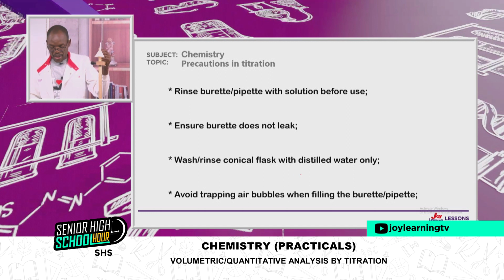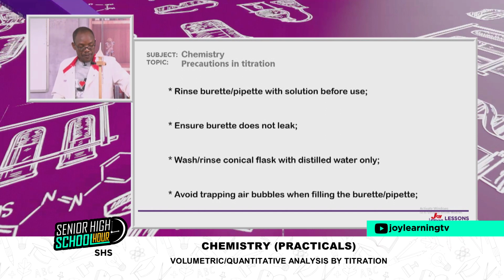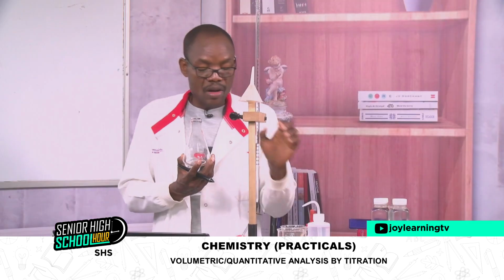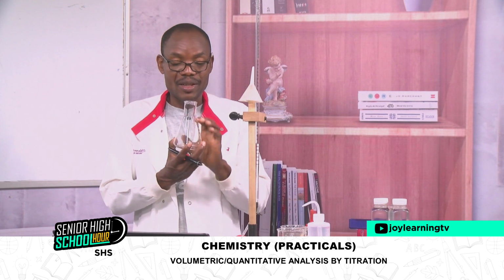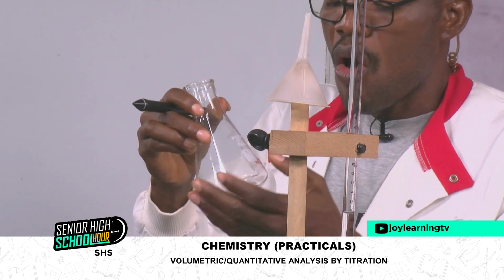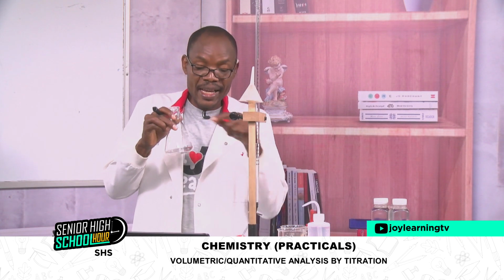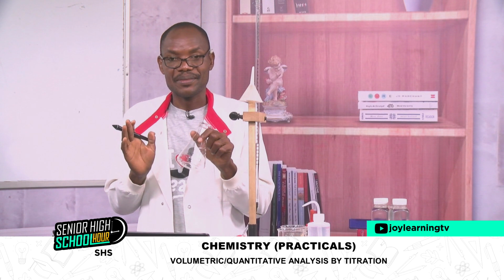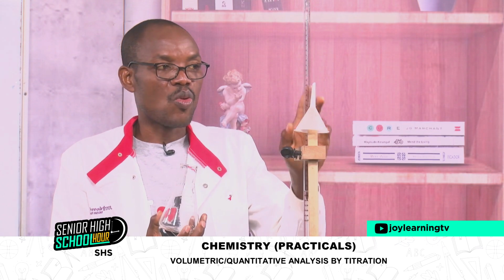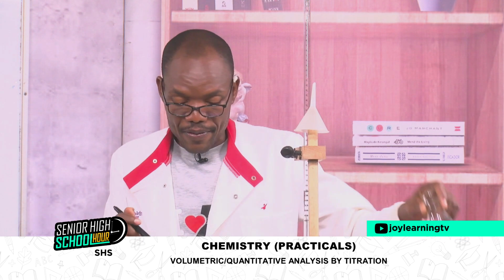Wash or rinse conical flask with distilled water only. If, for example, I'm going to use the base inside the conical flask, and I use a small amount of the base to wash inside the conical flask, to condition inside the conical flask, you cannot let go all of the base from the conical flask. So it means that if I go to pipette 25 cm cube of the base into the conical flask, the volume will increase. And that will also affect the endpoint color change and will affect your titer value. So only distilled water to rinse inside the conical flask.